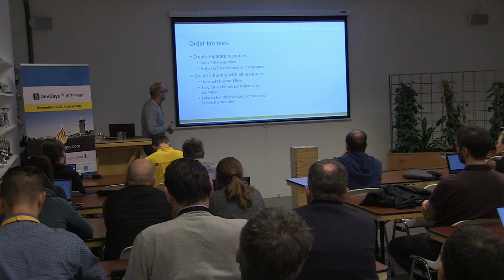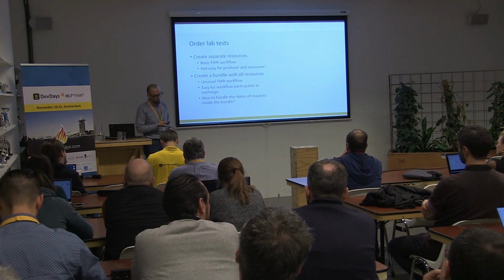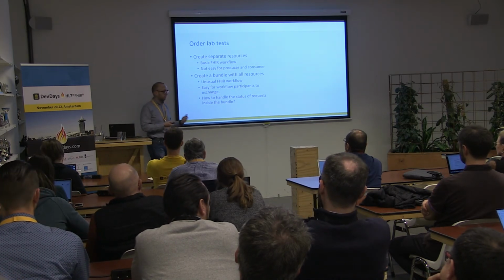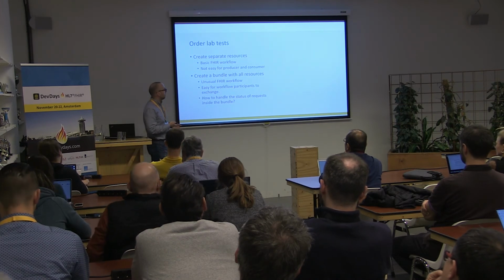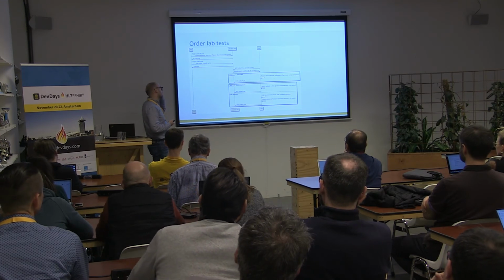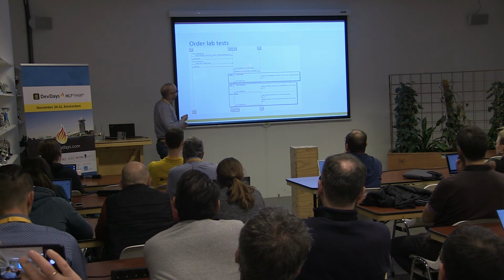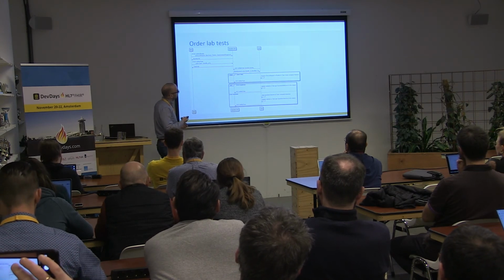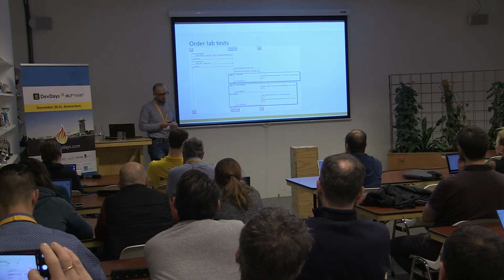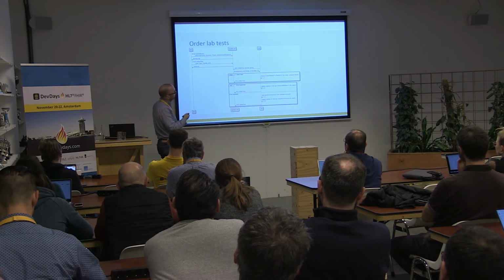But here we have a problem: if there were several requests inside a bundle, then we have to report that some of the requests were completed by a laboratory. And our customers suggested we do something like this. When the laboratory receives a bundle, it creates contained subtasks in the task and tracks information about the service requests from the bundle in these fields.